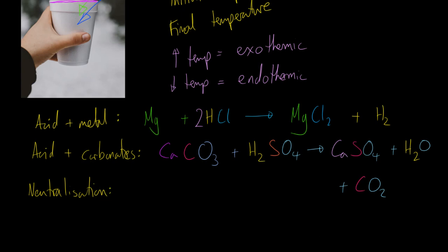You may do a neutralization reaction. So that's going to be something like HCl, an acid, plus NaOH.